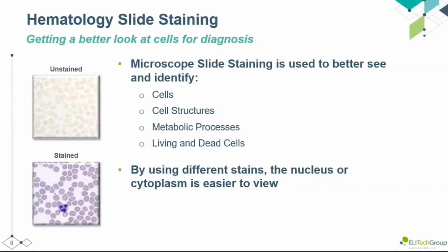We've discussed the importance of being able to visualize infections, metabolic processes, and many other pertinent details. Unfortunately, the process is much more complicated than simply adding sample to a slide and looking at it under a microscope. Various stains are used depending on what you're looking for. There are many variations and specialty stains, but most stains will fall under one of these general categories.